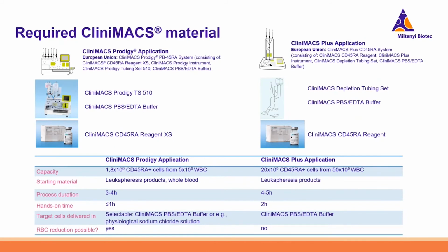Consumables for these procedures are supplied by Miltenyi Biotec. Two CE-certified medical device applications are available for the depletion of CD45RA-positive cells. The CliniMACS Plus CD45RA system provides a semi-automated procedure for starting products containing up to 50 times 10 to the 9 white blood cells.